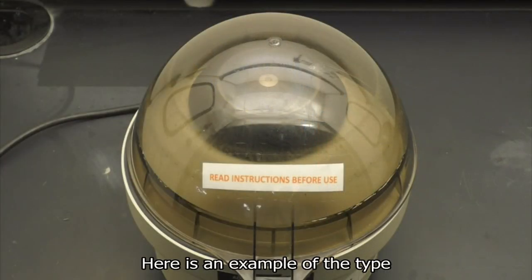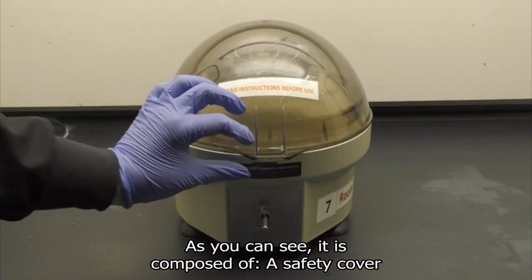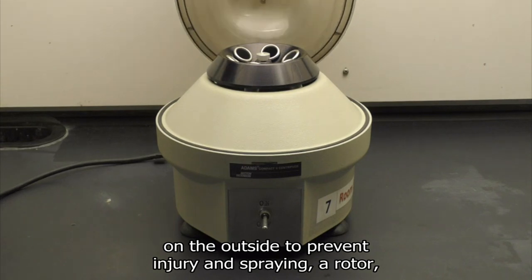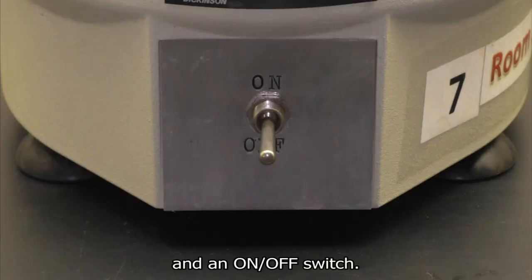Here is an example of the type of centrifuge you will be working with. As you can see, it is composed of a safety cover on the outside to prevent injury and spraying, a rotor which spins when the centrifuge is operating, and an on-off switch.